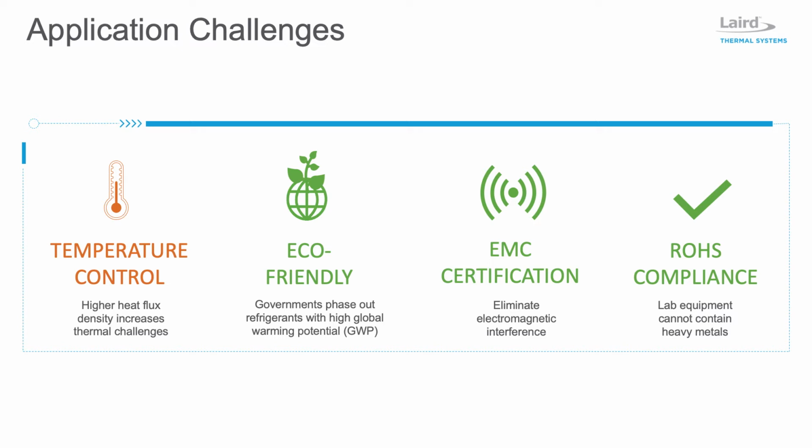Cooling systems must also meet UL 61010-1 or IEC 61010-1 lab safety standards to verify that units are not hazards to operators and the surrounding environment and equipment. European manufacturers must comply with RoHS, which means that the equipment does not contain lead, mercury, cadmium, and other heavy metals.